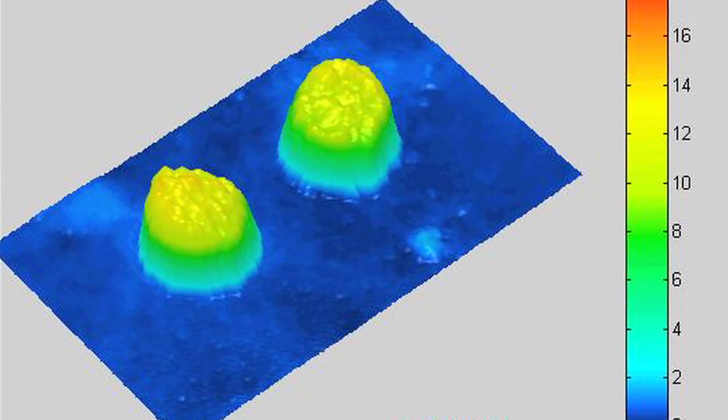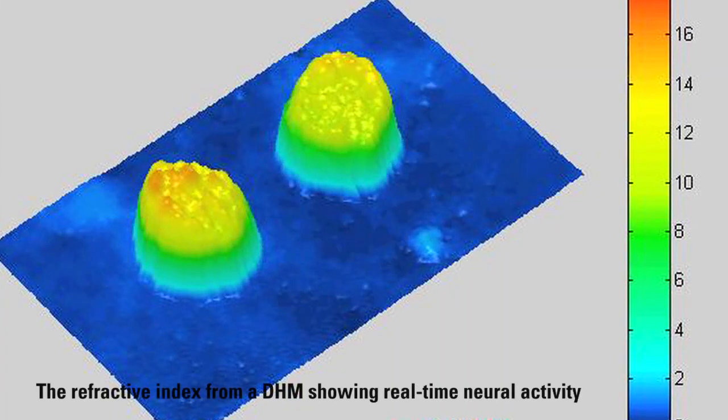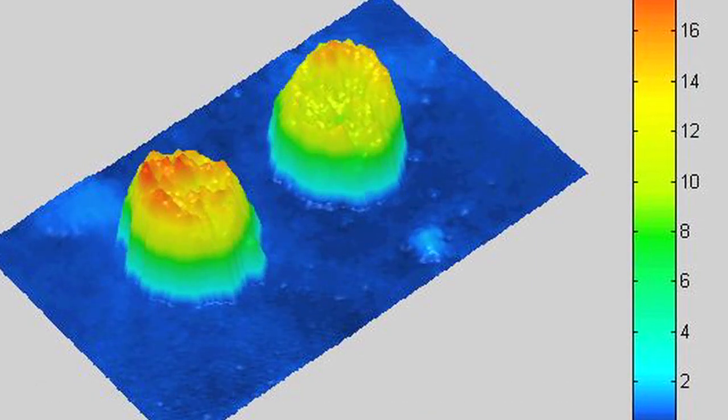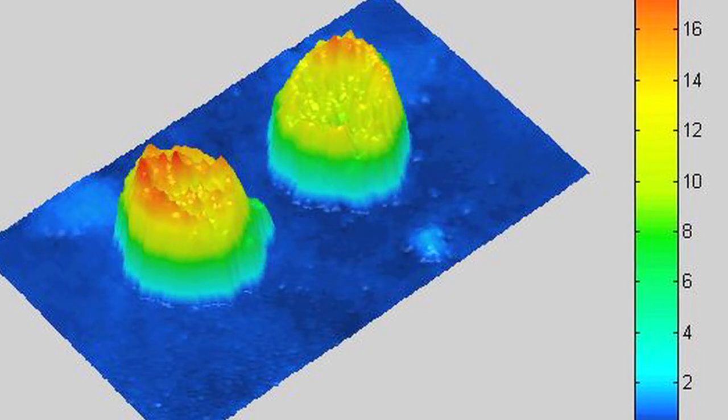Digital holographic microscopy uses coherent light — meaning a laser — that we send through the cell, collect the information, compare it to a reference beam, and then this reconstruction allows us to define and visualize the shape of the neurons in a dynamic fashion. One of the important applications of this method is that one can detect the activity of neurons.